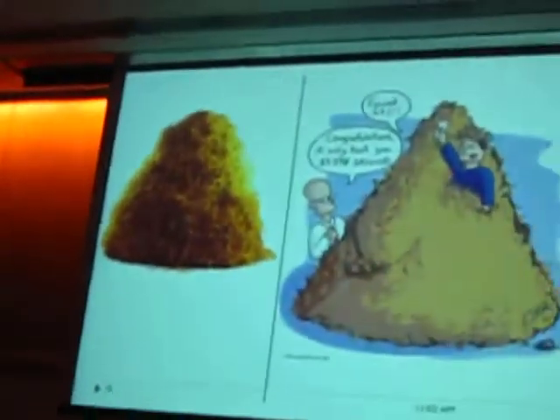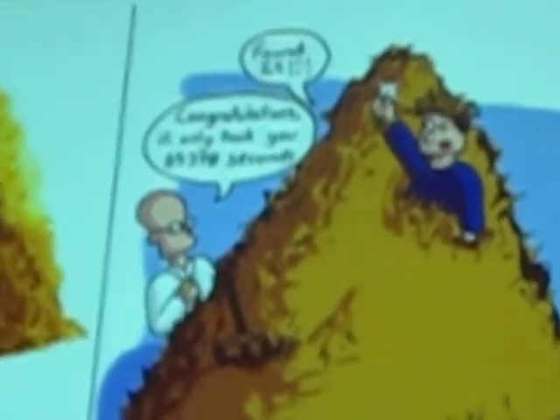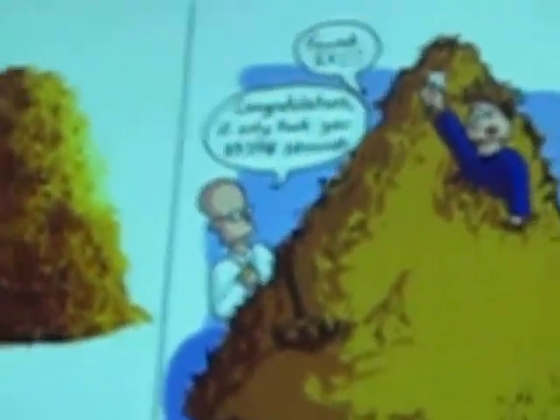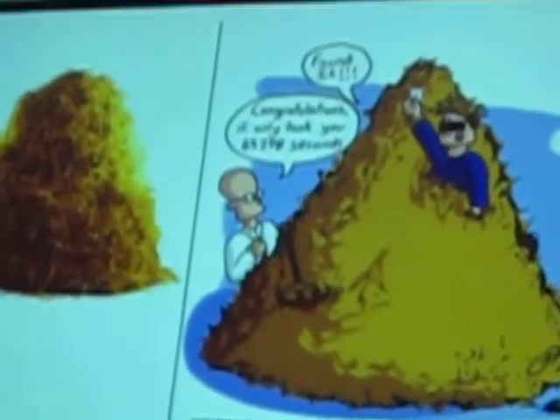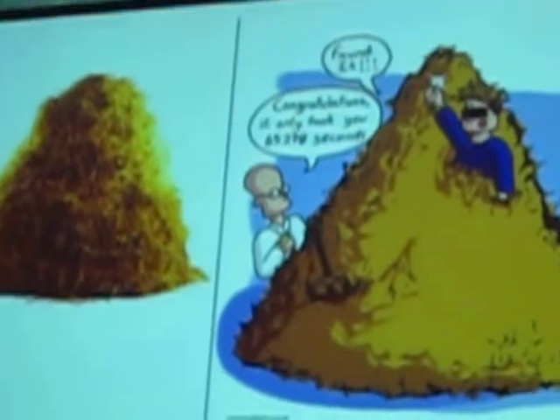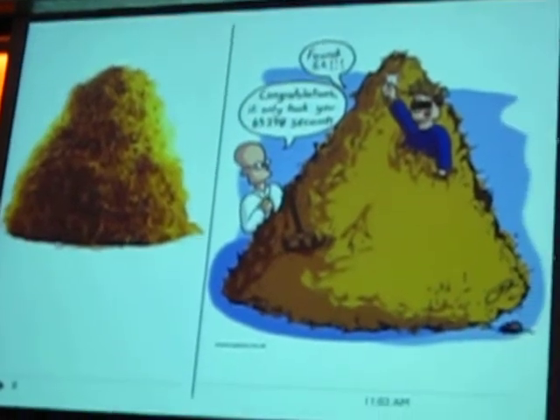So what the problem looks like when we have a simple protein spectrum, it's just a haystack. Just blindly pick a hay and try to characterize it: what's the length, what's the composition, what's the amount of carbohydrates or protein in it, and yes, we are done. But when we have cross-linked peptide, it's like finding the needle in the haystack, but not just looking at it. You are blindfolded, and you don't only have to find the needle, you also have to characterize it. What does the needle contain? What is the length? What is the composition, iron, nickel, whatever it is?